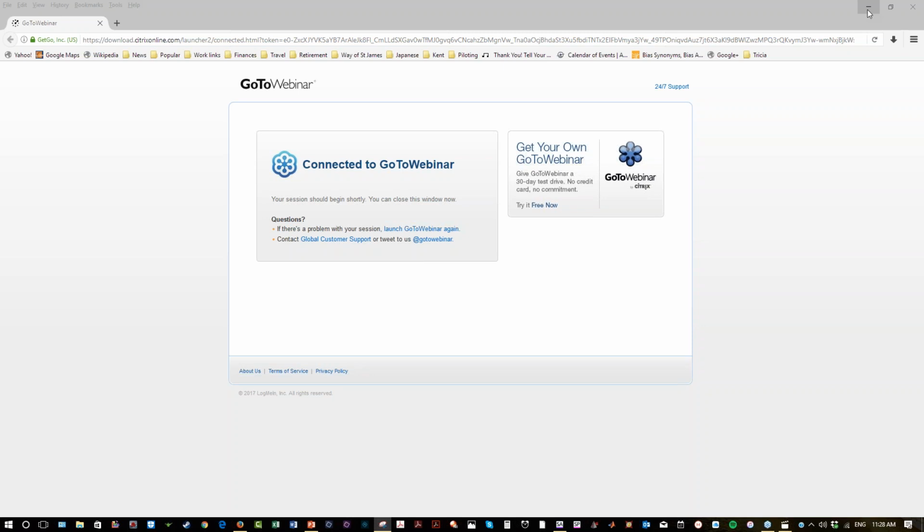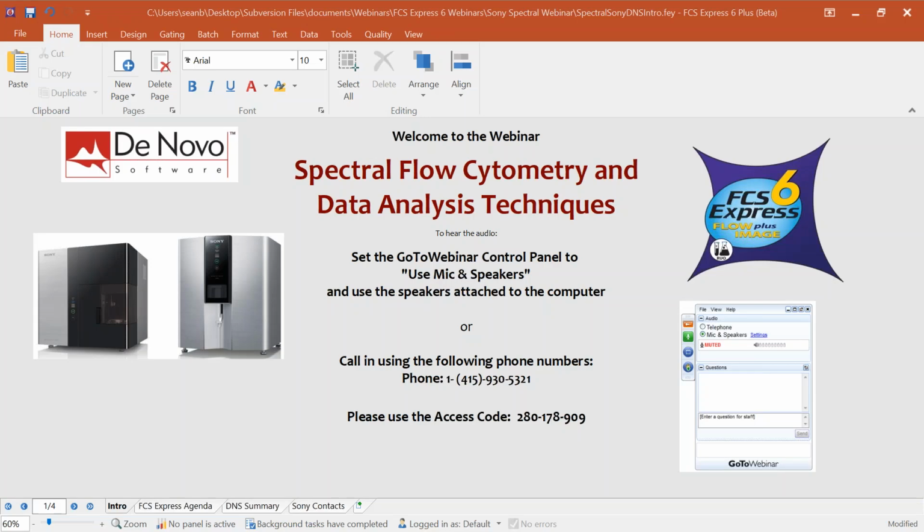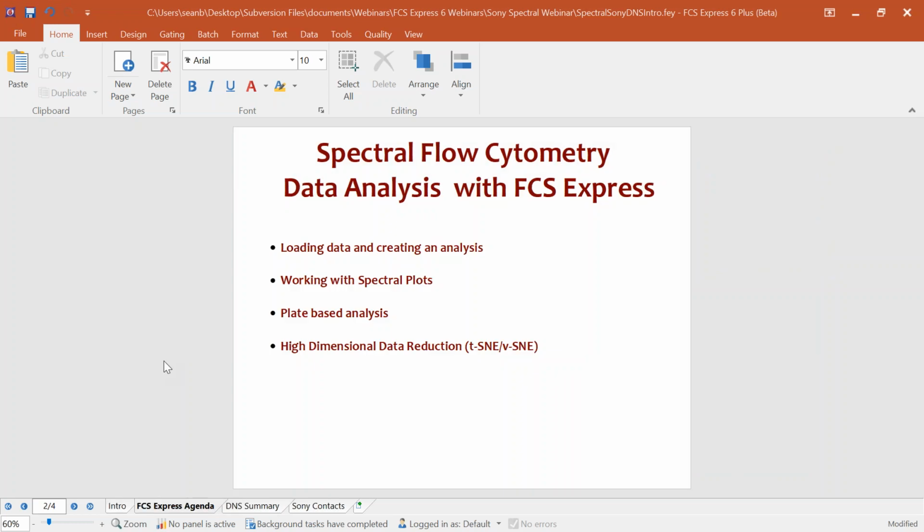So what we'll do here is bring up my screen again. And again, if you have any questions about the technology and acquisition portion of the webinar, I do encourage you to enter them into the question and answers panel at this point. We'll make sure to come back at the end to address those questions as well. And what we'll do now is start having a look at what you can do with that data in FCS Express. So as you just saw, Greg had chosen to export the FCS files and what's called SRAW file types.